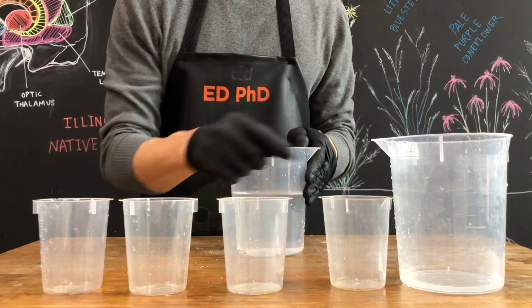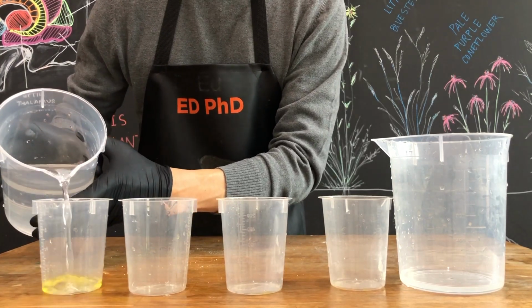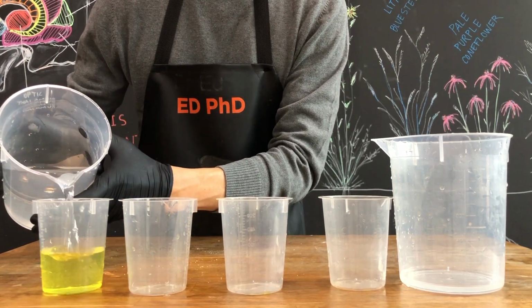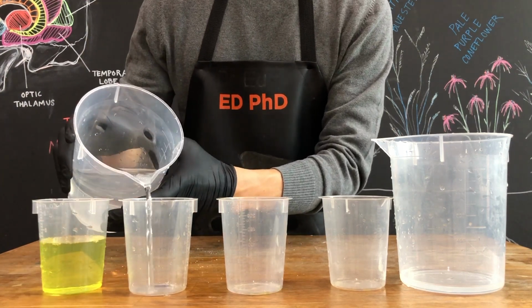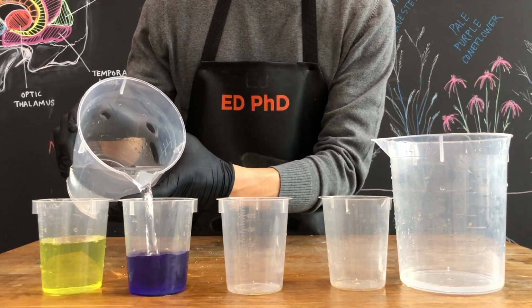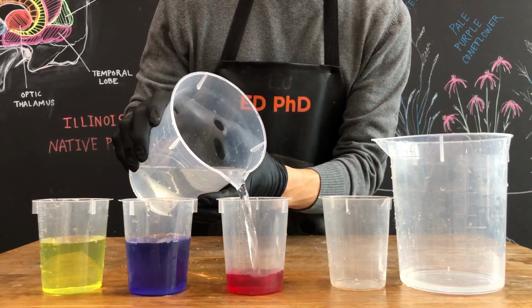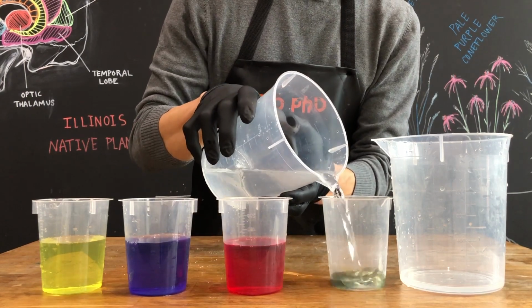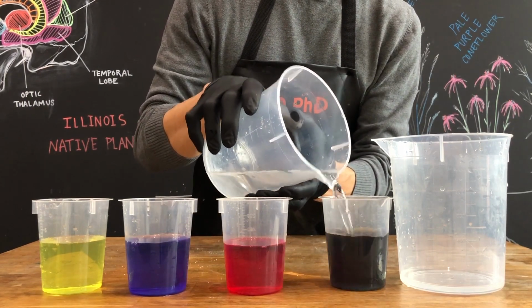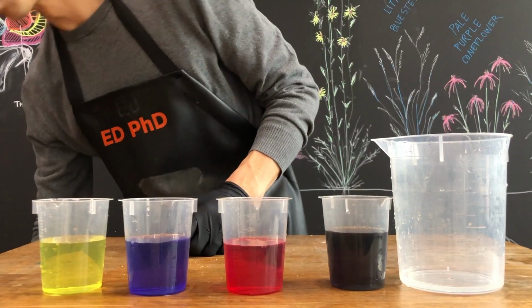In what looks like 4 empty beakers, we added a pH indicator, or a combination of pH indicators. These are chemical compounds that allow you to determine the pH of a solution visually. We use 3 indicators that are colorless in an acidic solution, but turn either red, blue, or yellow in a basic solution, and we use the combination to get the green. The solvent of each indicator evaporates quickly, leaving a seemingly empty beaker with the residue of the indicator or indicators at the bottom of each beaker.